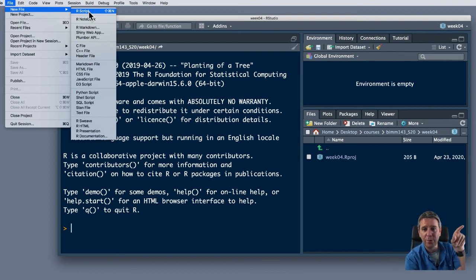It'll open a little panel up at the top corner here once I finally click on it, and I can put my commands in and it'll store them. And then if I ever want to redo my work, I can just execute that, and I can go have a cup of tea or coffee or whatever more fun thing I want to do, and the computer will do all the boring drudgery analysis for me. I can just change the input and it's automated all my work, and that's a big win, right?